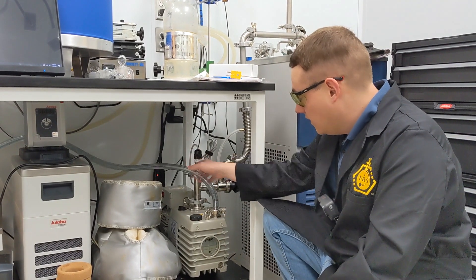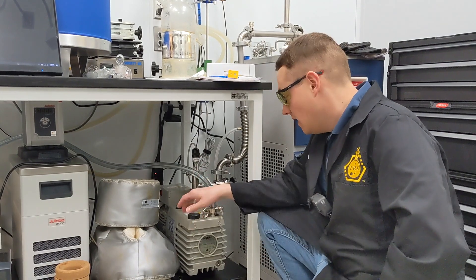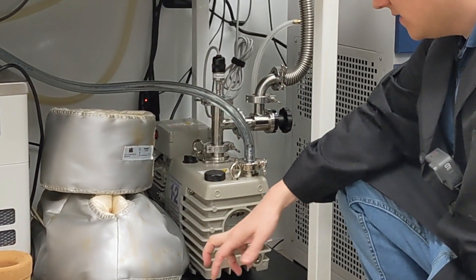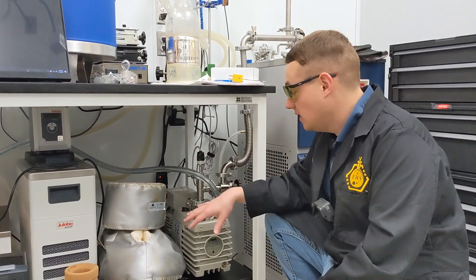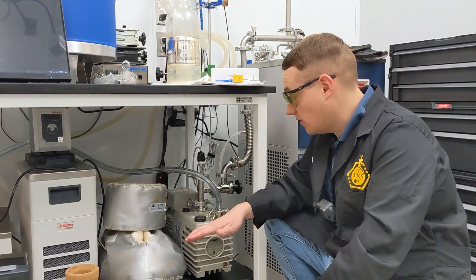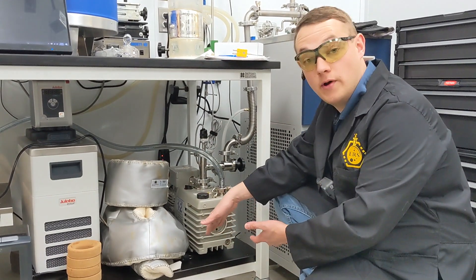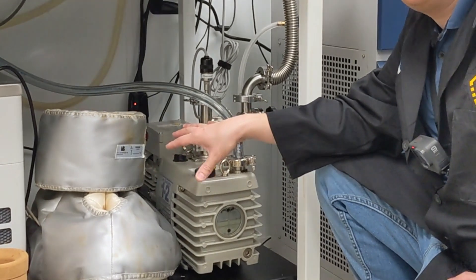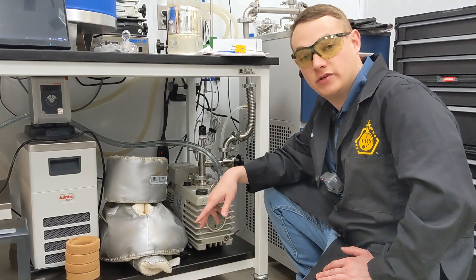We have the inlet here and the exhaust here. We'd always want to have an exhaust filter on a vacuum pump — mine got clogged and is getting serviced right now, which you want to do regularly. The mists that come out of the exhaust contain harmful vapors, ones that could be carcinogenic among other things. The oil mist is comprised of things that boil off from the highly fractionated pump oil itself, as well as whatever's in the system. These pumps are great for pulling deep vacuum. You can use them in wet applications, but you'd never want to use this on solvent recovery or filtration, because you'd be sucking solvent directly into your oil reservoir, changing the specific gravity of the pump oil and yielding a non-performing pump. These pumps are ideally suited for applications that might have some vapor load but typically operate in a higher vacuum range, or for evacuation of large vessels.